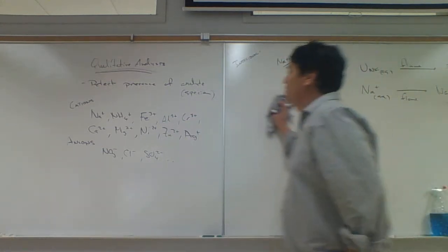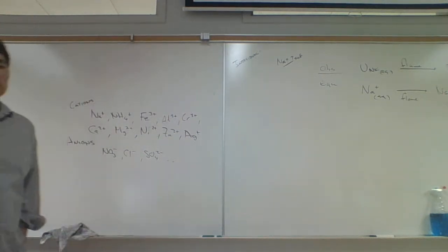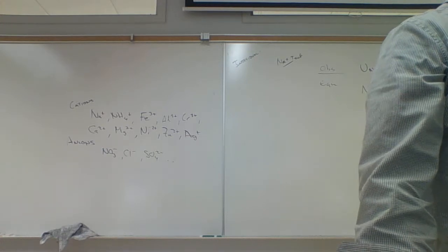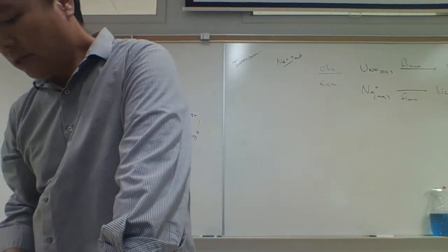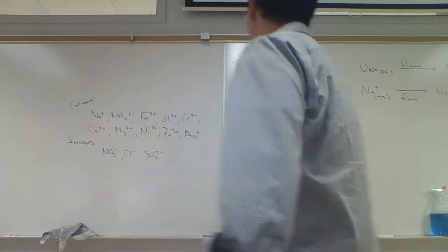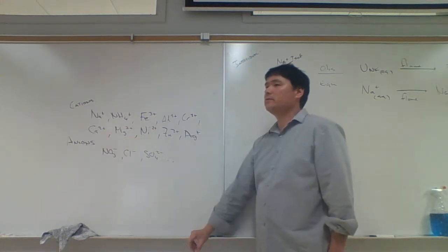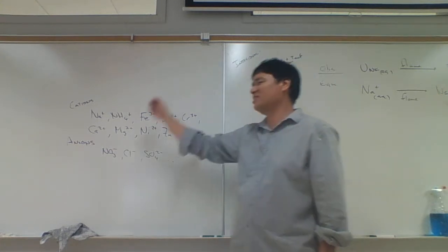We're also doing an individual test for ammonium, but before I talk about the ammonium test, cleaning this wire is not easy. You know, cleaning this wire takes a lot of time. And we're not just doing the sodium test. We're doing one more flame test. The other flame test we're doing is calcium. And so you don't want to have to clean the wire twice. So what we're going to do is we're not going to do the sodium test yet. We're going to postpone the sodium test until calcium's ready.